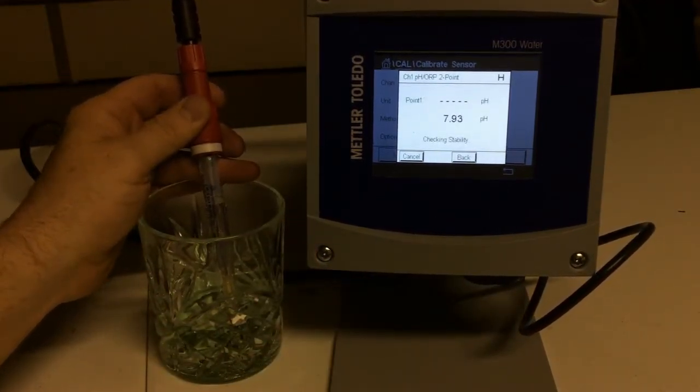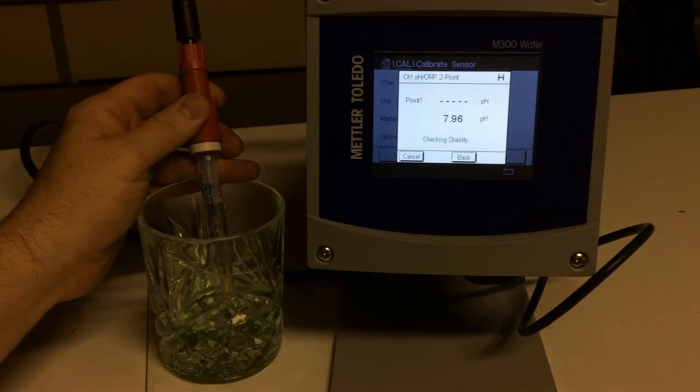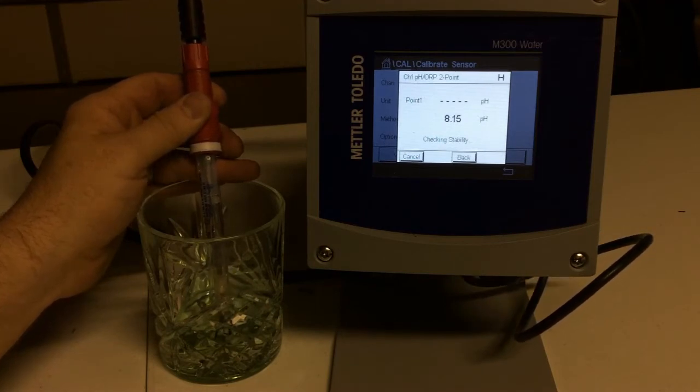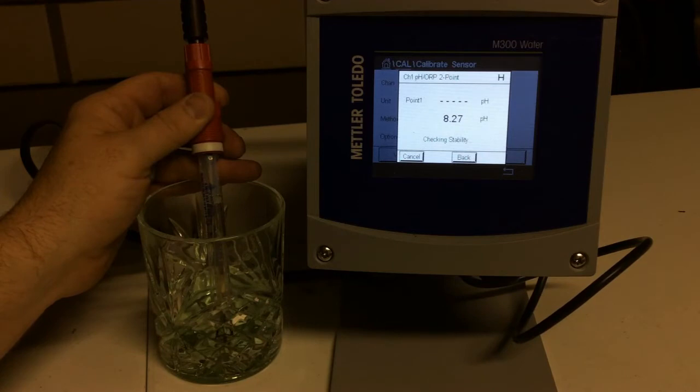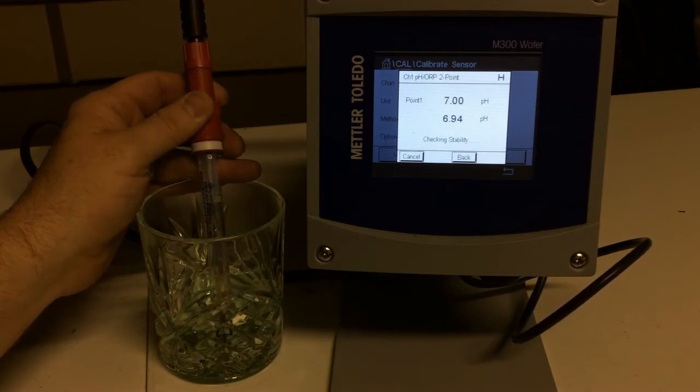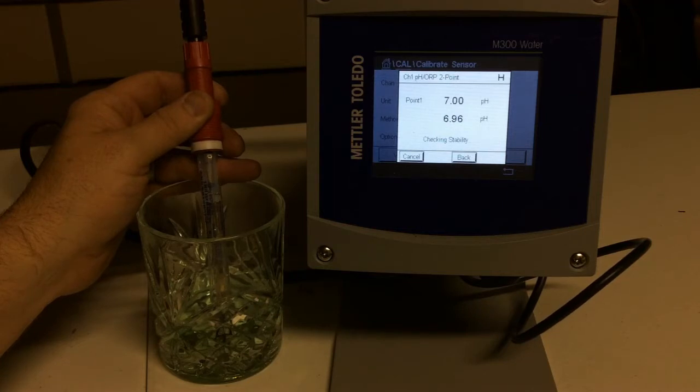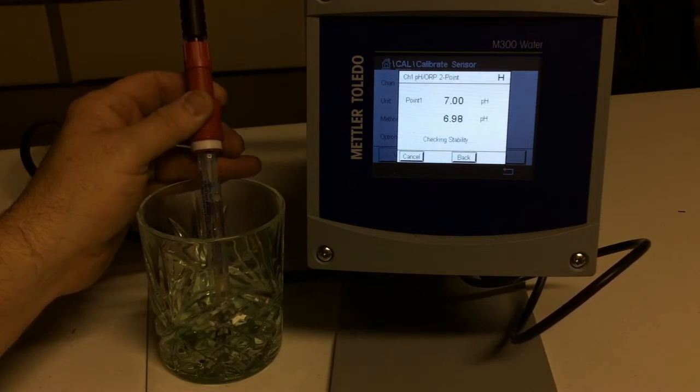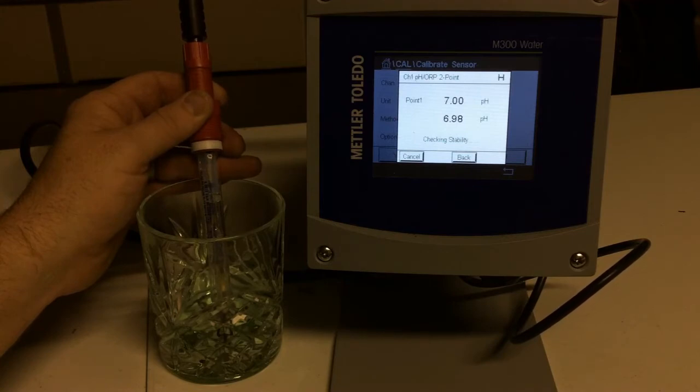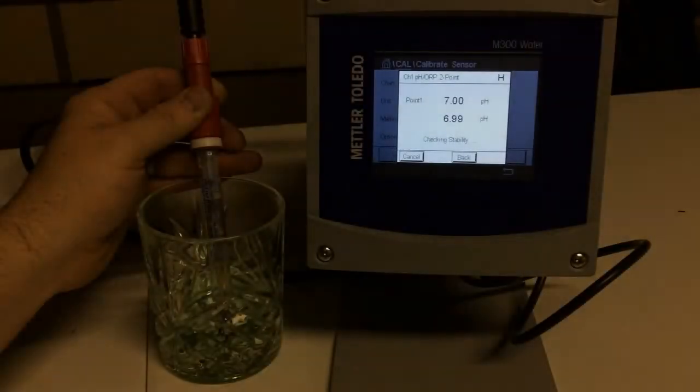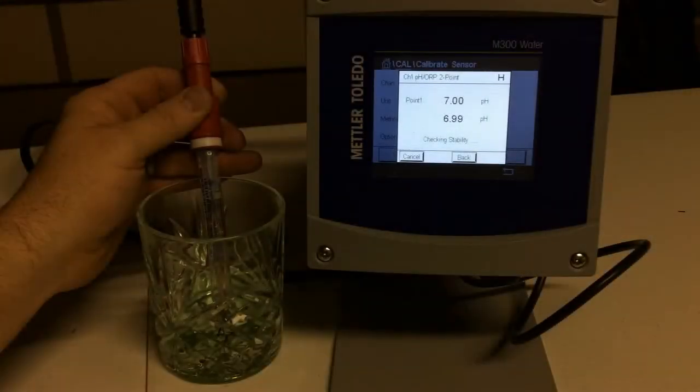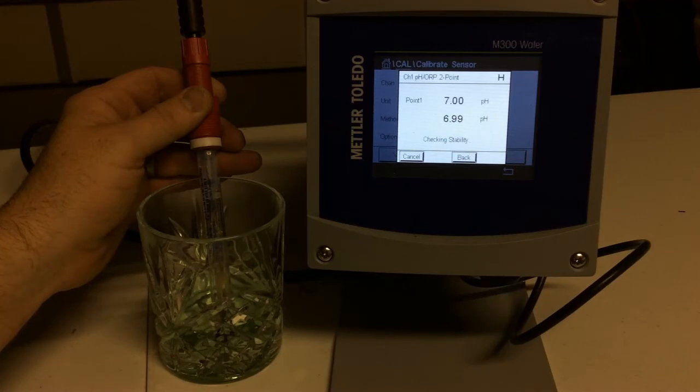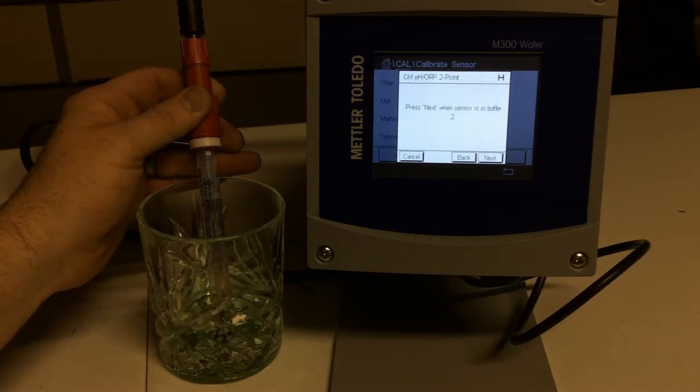And so I've got it into buffer one, and I'm going to hit next. And so you can see the H that's flashing at the top of the screen. That means we're in a holding pattern while we're calibrating, that way no readings of our Cal is going back. It is recognized as 7 pH, and it is calibrating to that 7 pH. So we have calibrated to our 7 pH, now put the sensor into buffer number two.